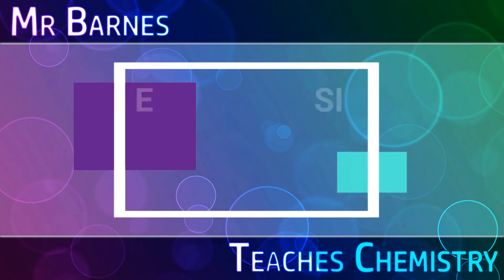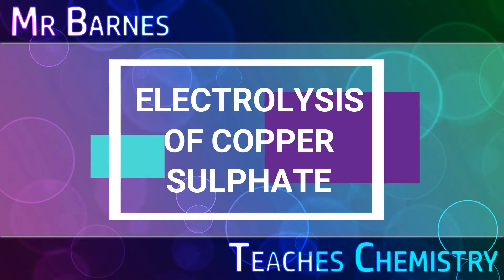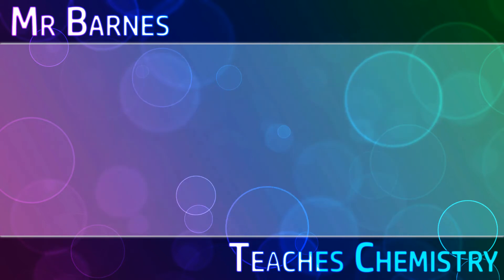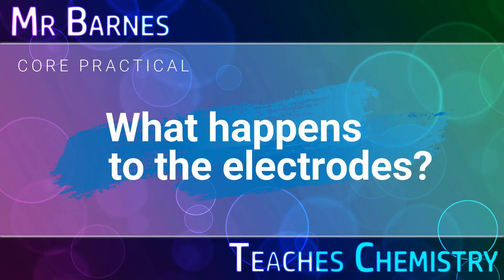Hi guys, welcome to this video which is going to be looking at the core practical and looking at how you can electrolyse copper sulfate with both inert and copper electrodes. The first thing being how do you carry out electrolysis of copper sulfate, and encompassing that, what happens to copper electrodes during this process.